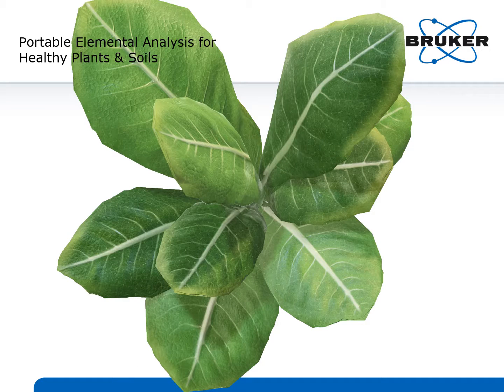Most plant tissue is cellulose-based, which proves to be a clean matrix for building a universal XRF calibration. Many people want to do live plant analysis, which is possible, but the relativeness of the data must be understood. For accurate and precise XRF quantitative analysis, especially when correlating to ICP results, samples should be dry, flat, homogeneous, and infinitely thick. Plant tissue does not exhibit any of those characteristics.